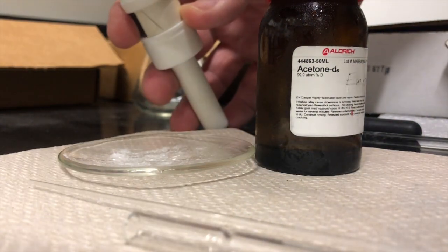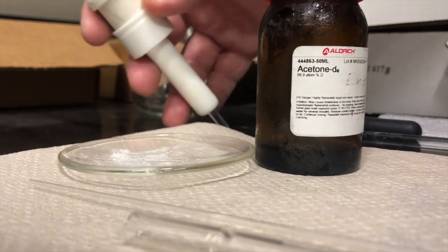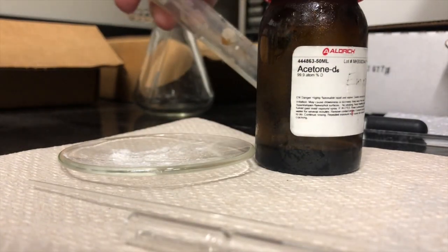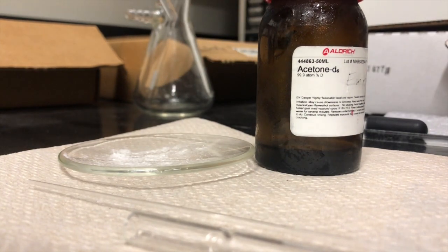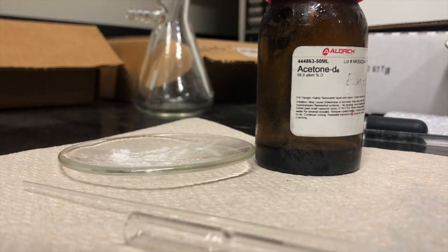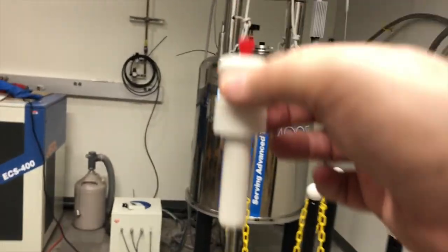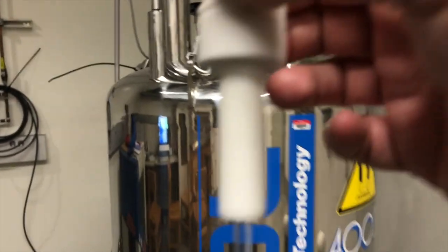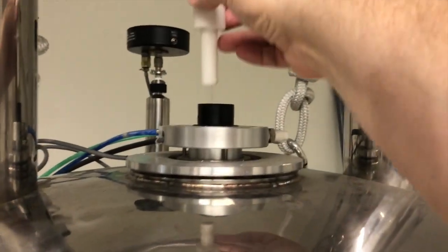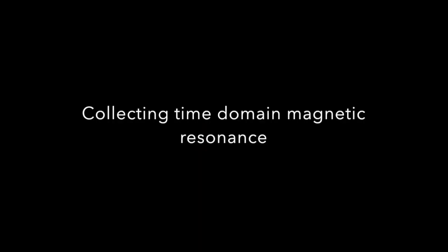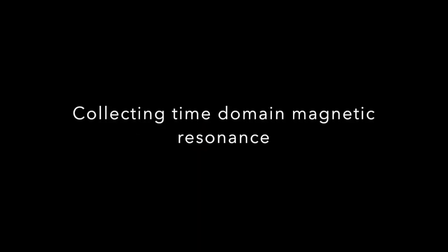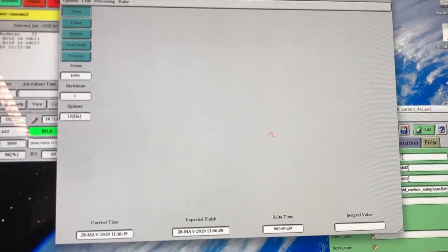Then we place the tube in a spinner. Make sure that the tube is at the appropriate height to be analyzed by the instrument. Then it is time to place the sample with the spinner into the magnet. You can see the sample will go down into the center of the large superconducting magnet. At this point we can start collecting the data.